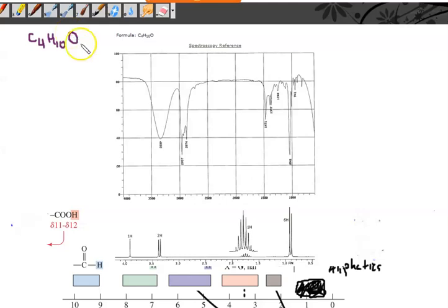All right, and this is going to be hard. But you see this little tiny peak right there? You guys see that little peak right there? Notice you have an exact matching one on the other side. So that is a peak. Those two are peaks. So 1, 2, 3, 4, 5, 6, 7, 8. So this is a nonette. It's called a nonette because it's 9 peaks. Okay, that's how you know if you're looking. You see, like here, you can see a little bit of a blip right there. That little blip right there. But I don't have it on the other side. So that's why it can't be a peak. That's just clearly a doublet.